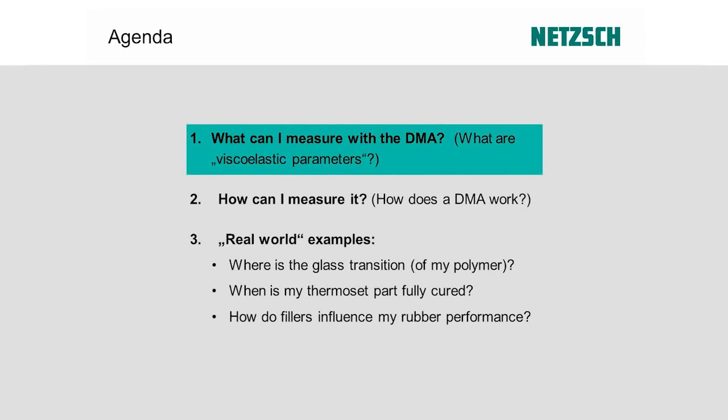So what can I measure with the DMA? What are viscoelastic parameters? So we start with some basics. How can I understand viscoelasticity?